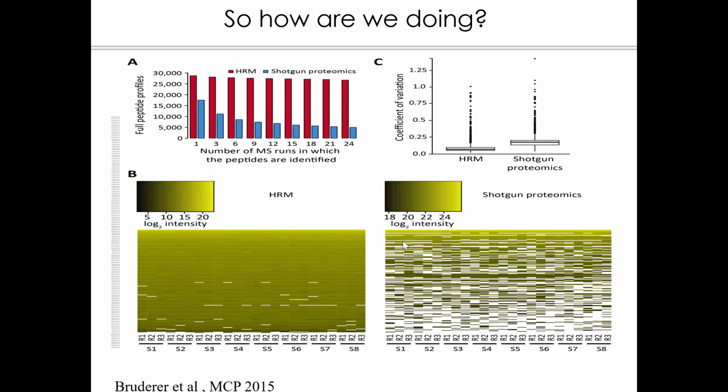So you get a somewhat erratic measurement, not a wrong measurement, but a leaky measurement, in the sense of such a matrix, where you see there are a lot of missing values, and the number of proteins or peptides really detected throughout is relatively low. When you think that you want to do some kind of machine learning or clustering, you can appreciate that with such a data matrix the results would not be as good as if you had a data matrix which is rather complete.